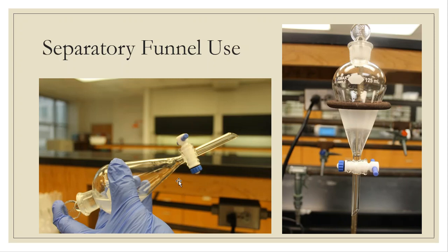So to the left, you're seeing me turn the separatory funnel upside down. My finger is on the stopper up here at the top, though, right? So that way it doesn't, of course, dump out and get liquid everywhere. And there goes my product. But methylene chloride is very volatile, and it builds up pressure. So one of the things I do is that I rock it. So I turn it over, and then I turn it up the right way. And then I turn it upside down, and then I turn it upright. Well, when I turn it upside down, sometimes I'll grab the stopcock, and I will slowly turn the stopcock open. And I have this pointed straight up in the air.